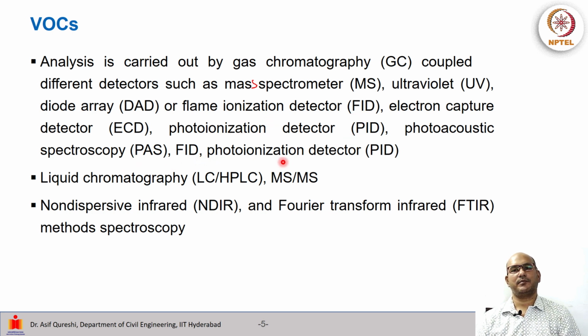FID and PID are already done. Sometimes samples may be analyzed by LC or HPLC-MS, or by non-dispersive infrared and Fourier transform infrared spectroscopy methods.